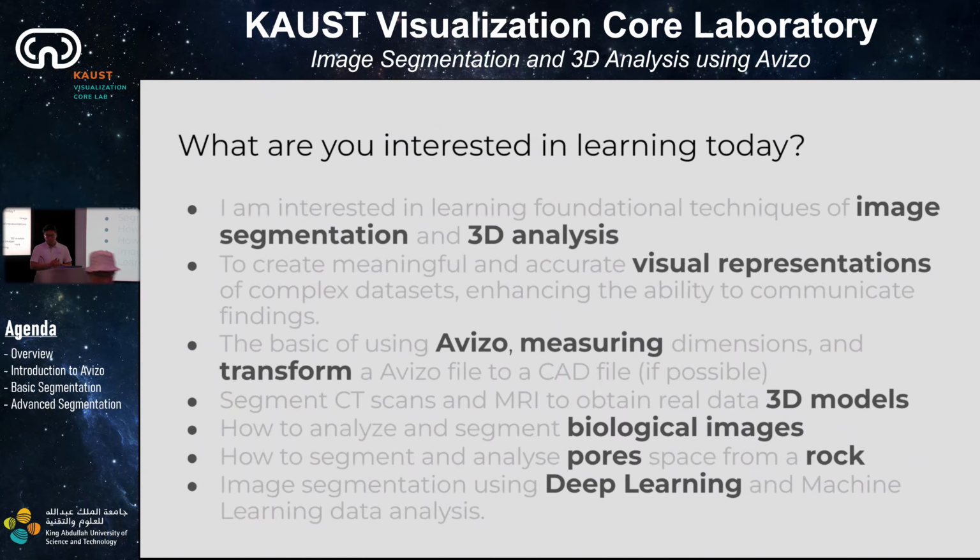Before or during the registration, I put a question about what you are interested in learning, what you are expecting to learn in today's workshop. I highlighted here some of the keywords that we will touch on today. Of course, segmentation and analysis are there. But it's not only that, we'll also touch a little bit on visual representations, or generating visualizations for your data, which you can use for your papers.